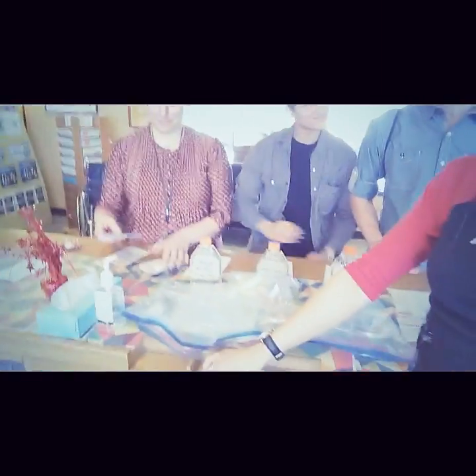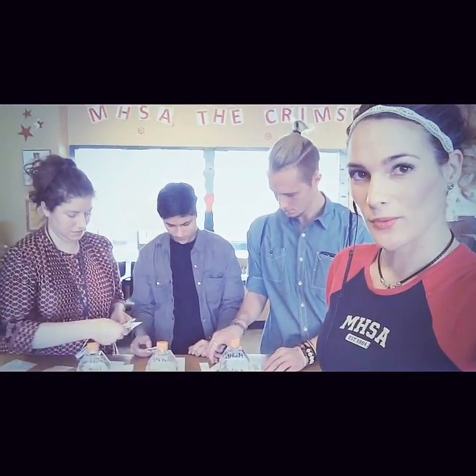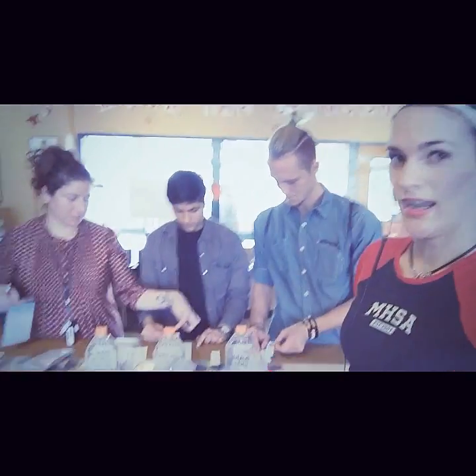Here we are at Milwaukee High School of the Arts. This here that you see on the counter, these are the samples that I collected from one home in Flint, Michigan. And so here we have Ms. Vicchio, our awesome science teacher, and these are two of our students here at the Arts.